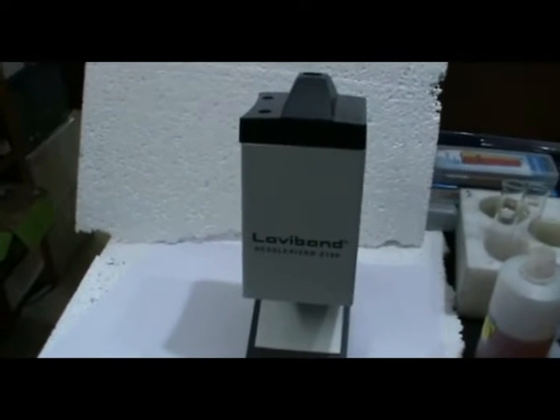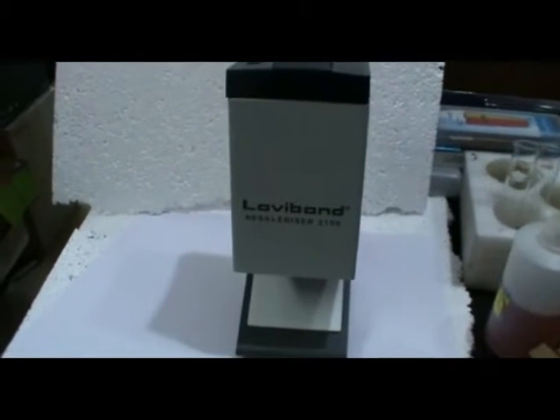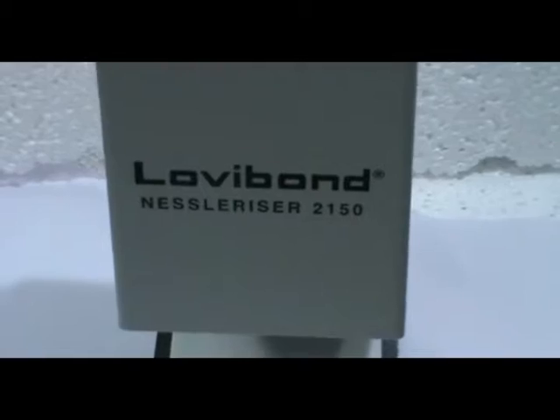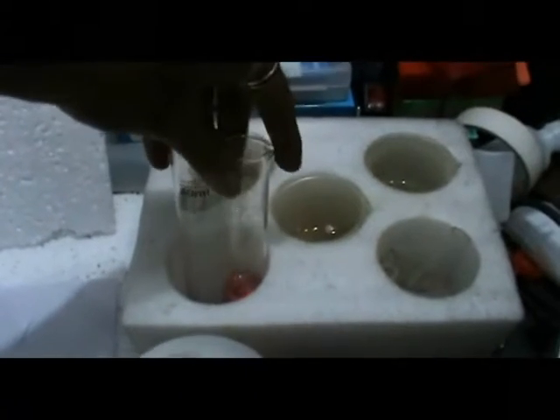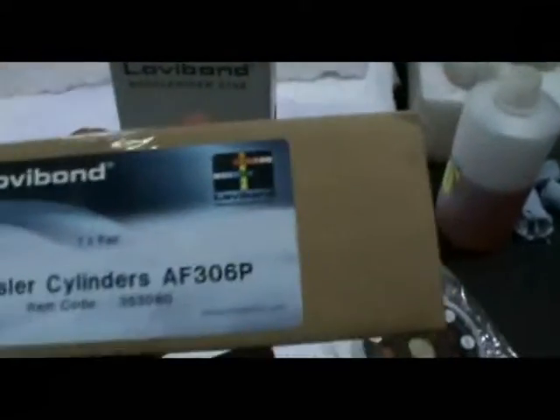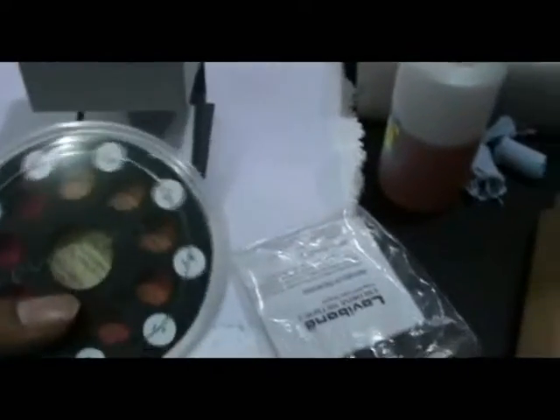Demonstration for the Low V-Band Nessler Color Comparator Model 2150. Accessories include the comparator with stand and one pair of Nessler cylinders. The disc is also optional. You need to buy a Nessler cylinder and disc separately.